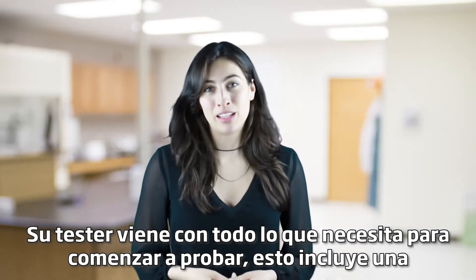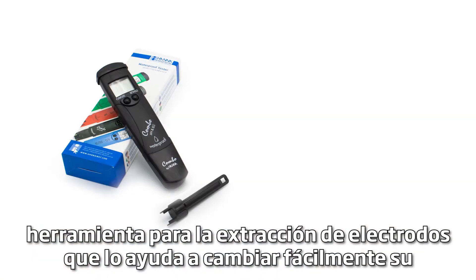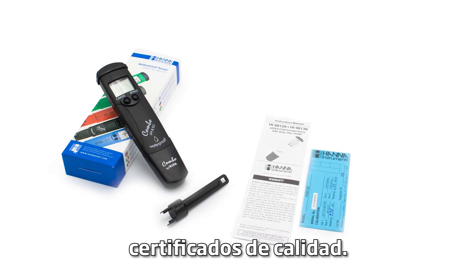Your tester comes with everything you need to begin testing. This includes a tool for electrode removal that helps you easily change your electrode if it ever needs to be replaced, an instruction manual, and a quality certificate.